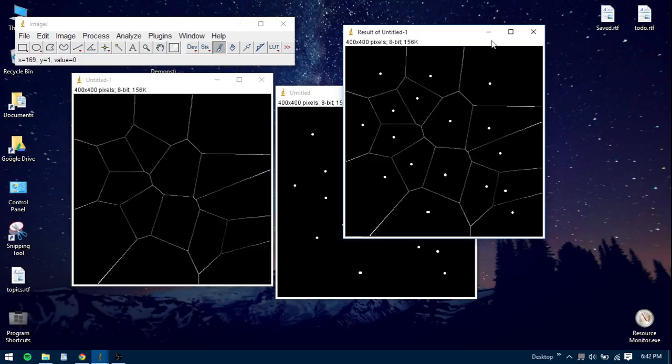That wraps up my quick guide to ImageJ, and if you have any more questions, just look at the documentation, or if I'm available, email me.